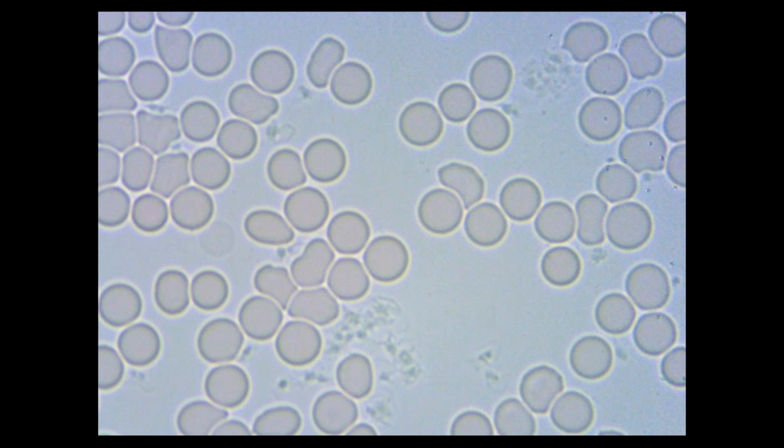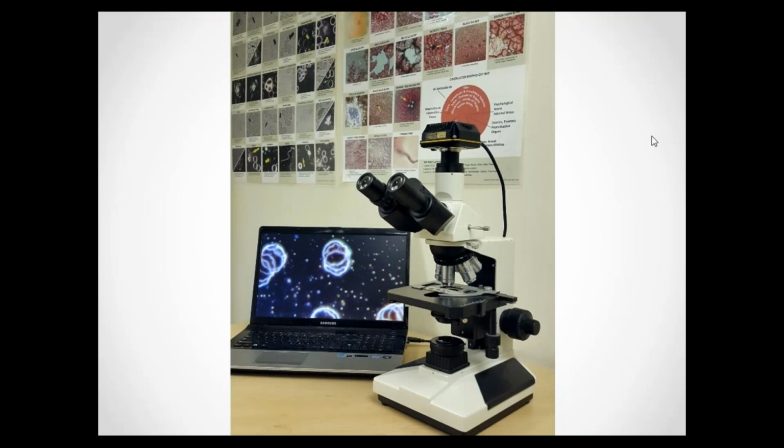But specifically the condenser, the little lens unit below the stage, sometimes when people start using the microscope and they're still not quite sure what to adjust and where, they adjust it by accident, and then the condenser is not always perfectly aligned in the center of the beam of light. But this is a fairly easy and simple procedure. This is something that the person using the microscope can actually do themselves. It doesn't really require a specialized microscope technician.